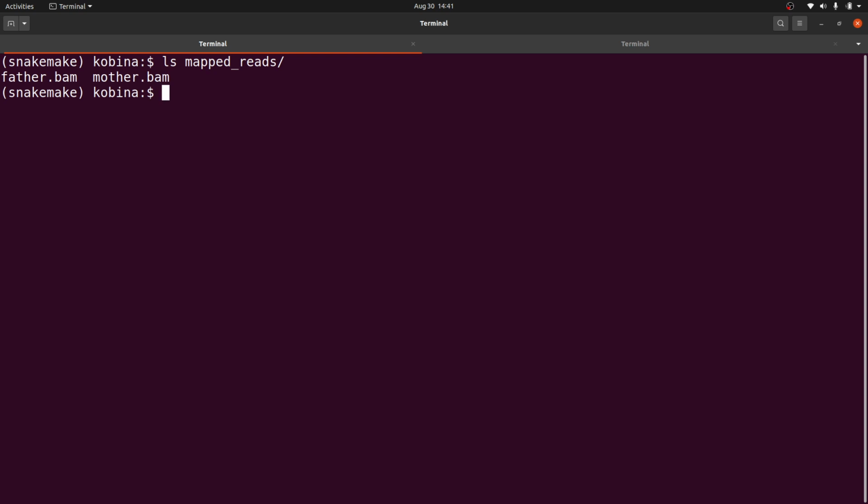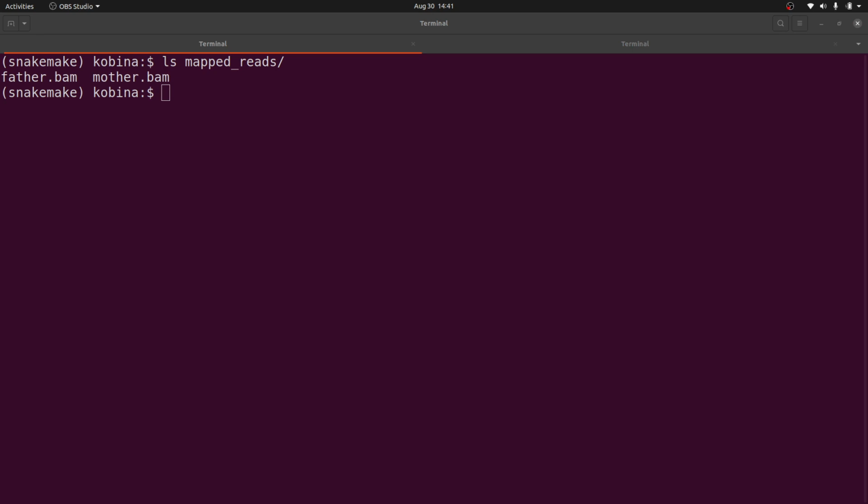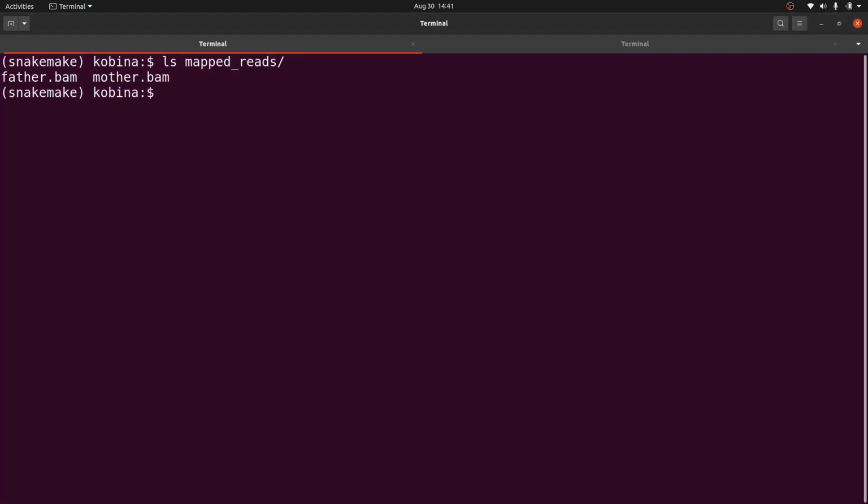So that will come in handy if you're handling multiple files. So let's do this. I want us to make a copy of the snake file. Let's do this. Let me just do this here. So I want us to do a copy.